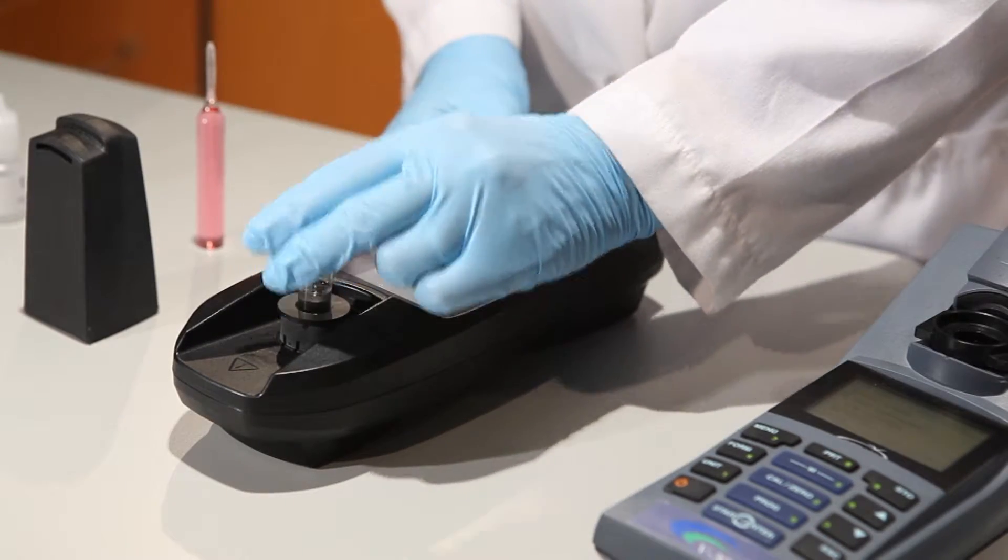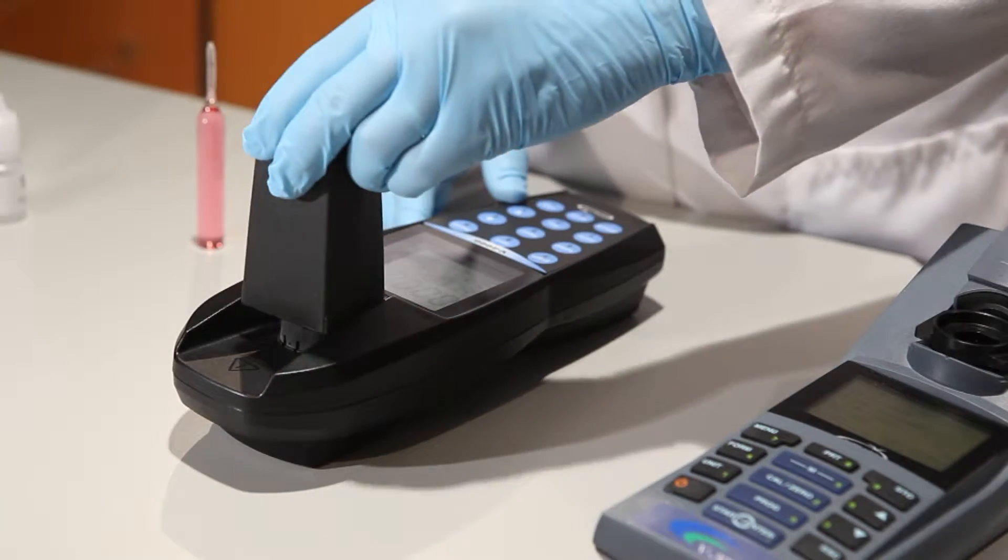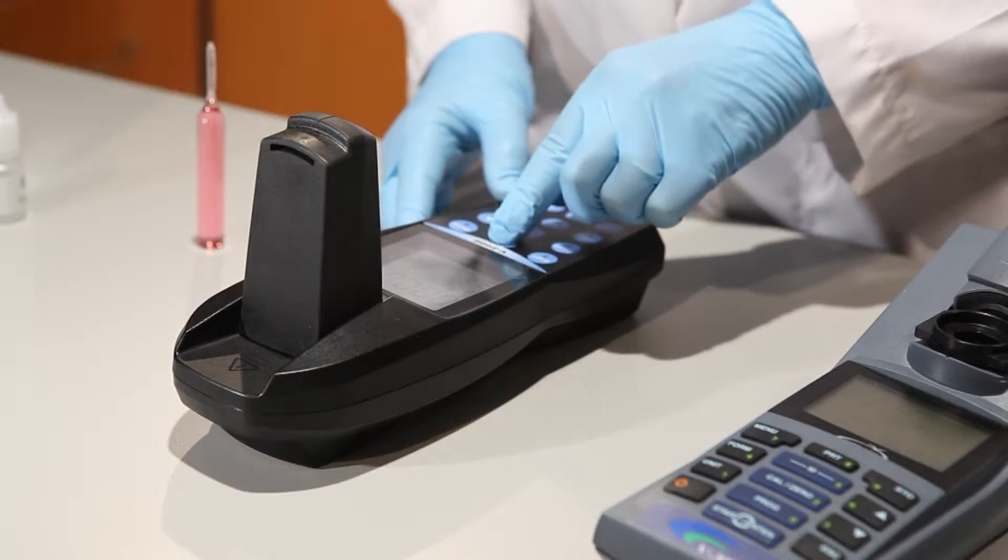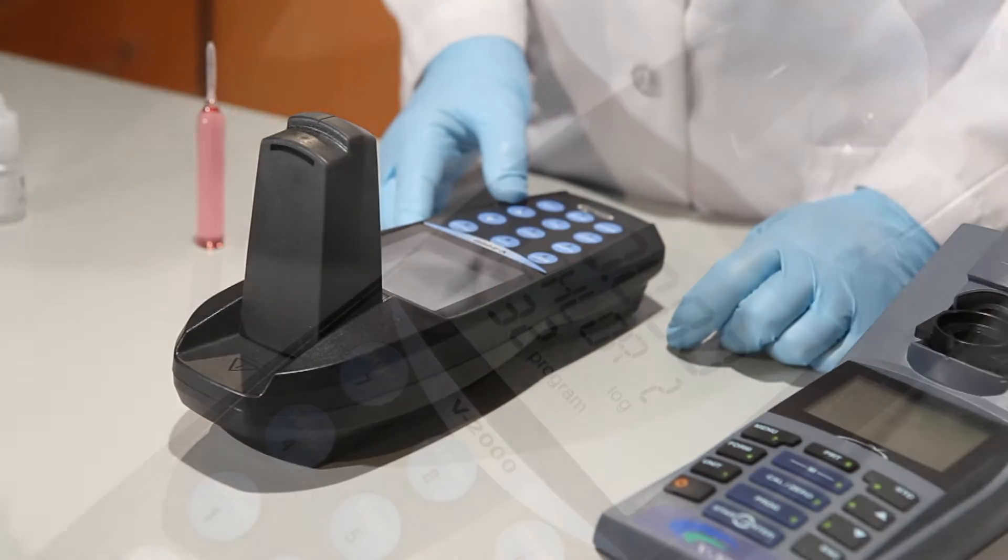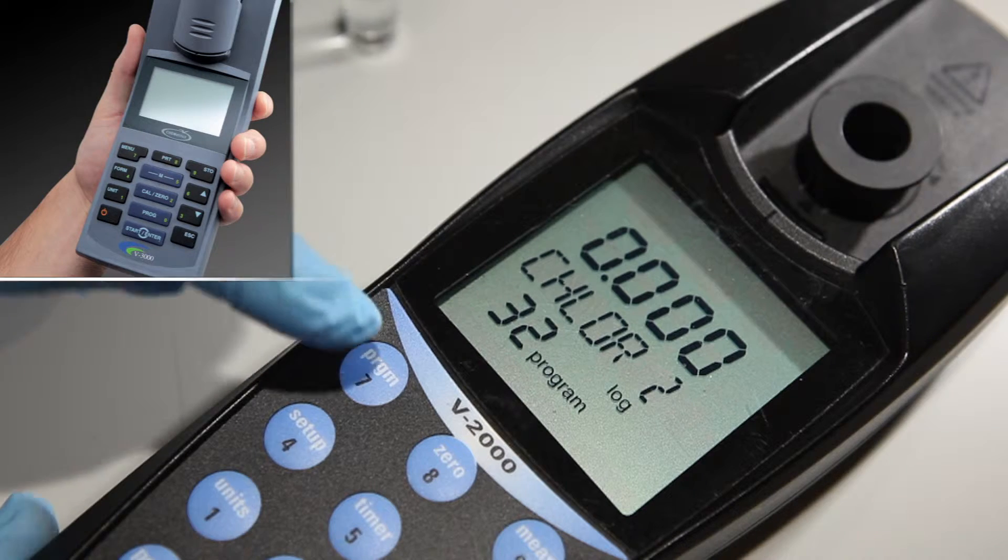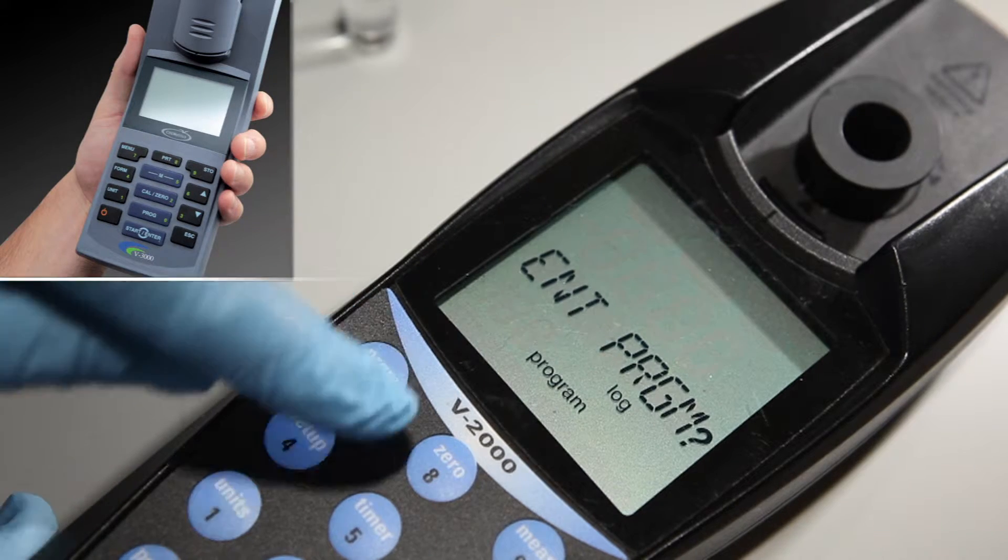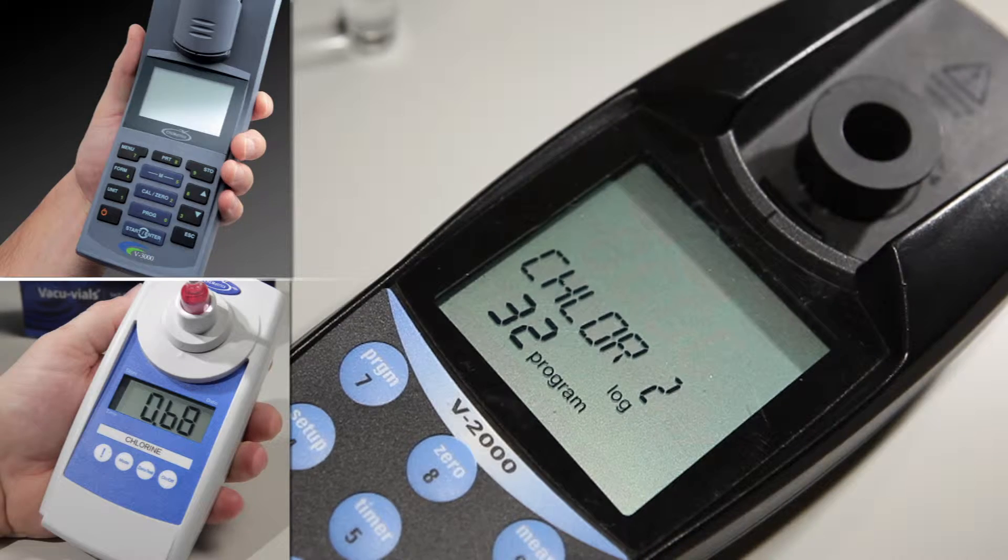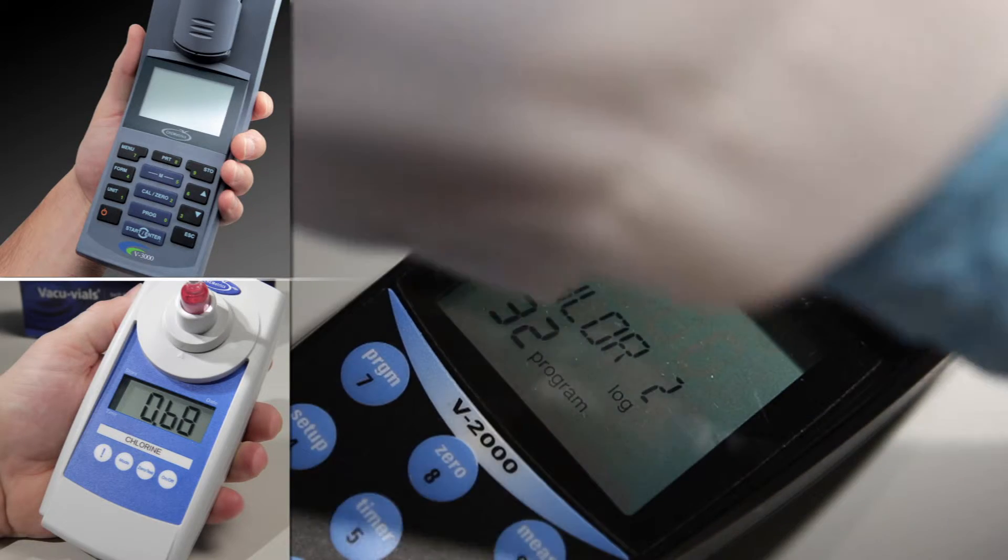Insert the zero ampule into the sample cell compartment. Cover the zero vial with the light shield and press the zero key. For the V2000 and V3000 multi-parameter photometers, select the appropriate program number. SAM single analyte photometers are factory set for a specific analyte.